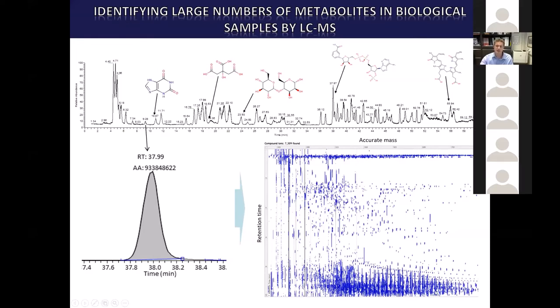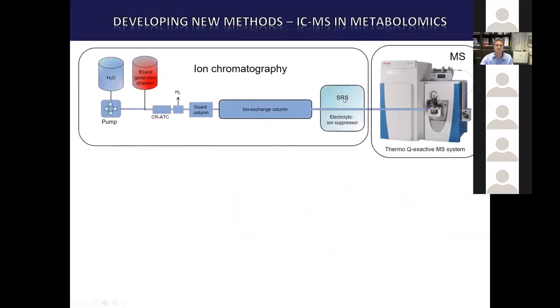So these things are going to be quite lipid-like, for example. These things are going to be quite hydrophilic. In fact, they may be ionic. And things in here, if it was reverse phase chromatography, would be well captured by the method. But it does highlight that obviously it's not capturing everything. It's one of the reasons we need to have multiple methods, multiple chromatographic methods, which is one of the things that we do, and also to develop methodologies that try and capture more of this chemical space.